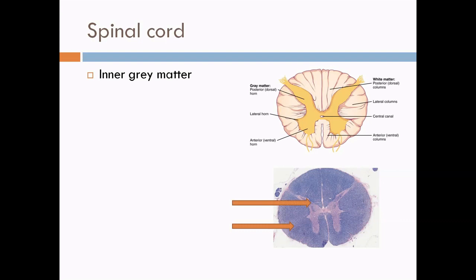The grey matter shows the anterior horn which contains the multipolar neurons, the cell bodies of the motor neurons. There is a posterior horn. In the thoracic and the upper lumbar regions there is a smaller lateral horn which gives rise to the sympathetic fibers.